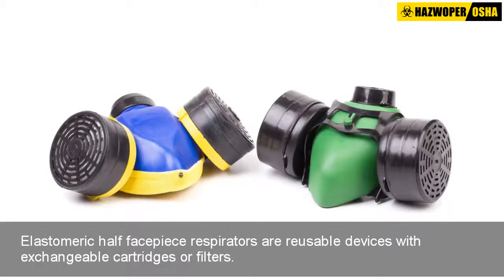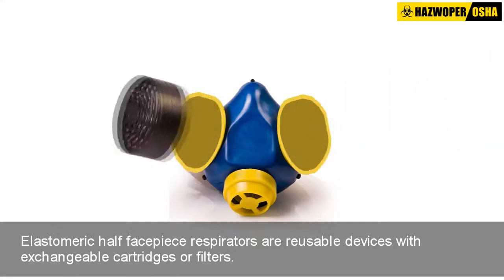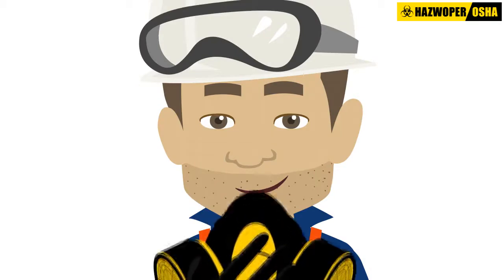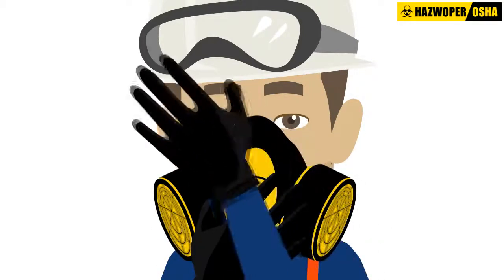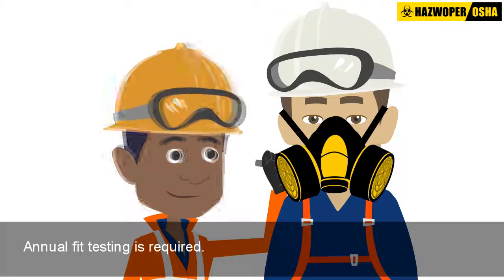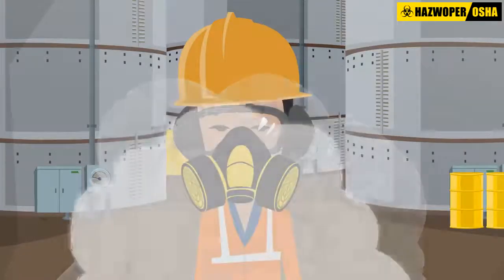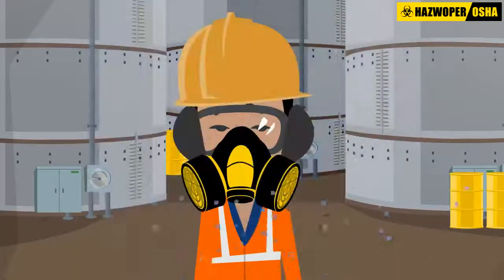Elastomeric half facepiece respirators are reusable devices with exchangeable cartridges or filters. The facepiece is made of rubber or silicone that forms a tight seal against the user's face, covering the nose and mouth. Therefore, annual fit testing is required to ensure optimal levels of protection. Elastomeric respirators can be used to protect against gases, vapors, as well as particles if equipped with the appropriate filters or cartridges.